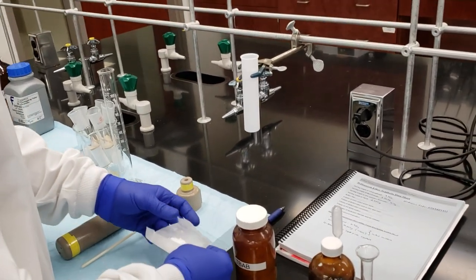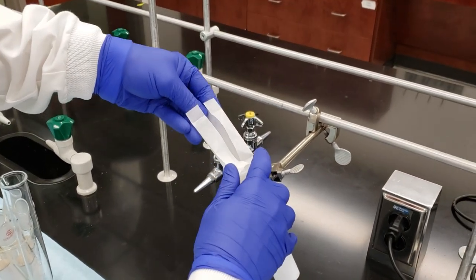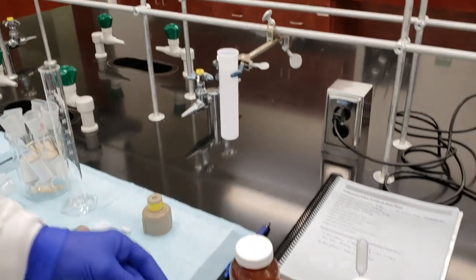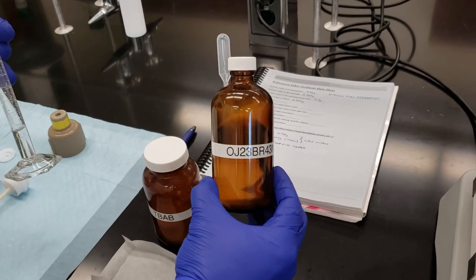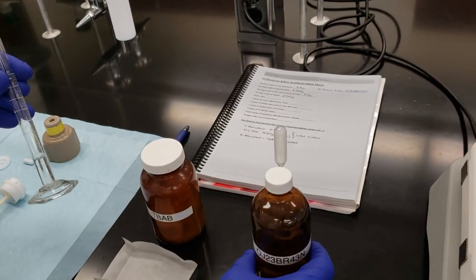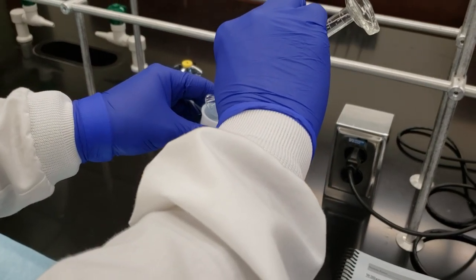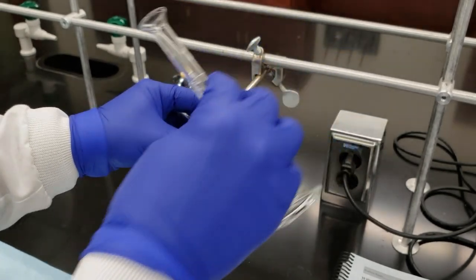I'm going to take my TBAB, I'll fold my paper here. This is the inner sleeve of our microwave vessel. So that's adding our TBAB here. We've got our unknown, our code is OJ23BR43N, and that's written on our data sheet. So that's going to be the unknown alkyl halide or alkyl bromide that we're going to be identifying. Go ahead and pour all of our alkyl bromide in. Okay.